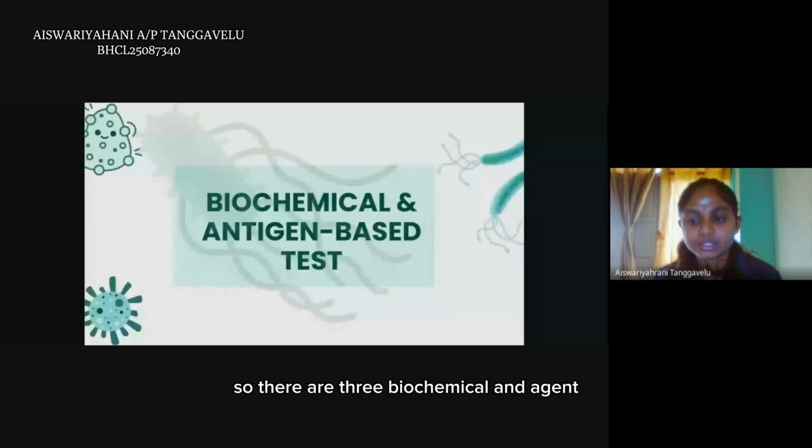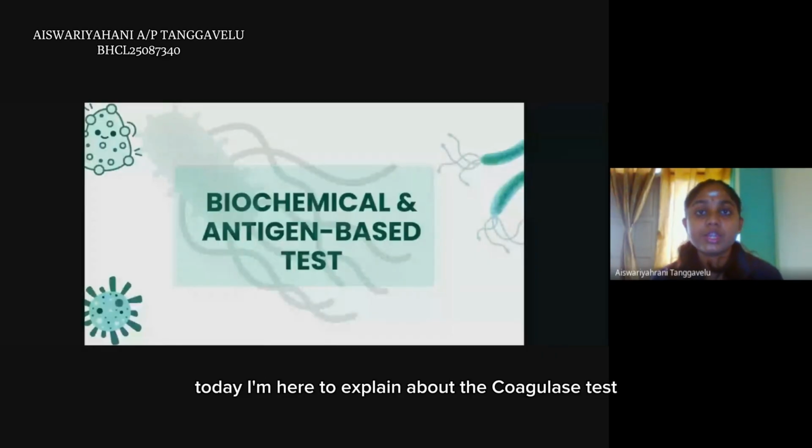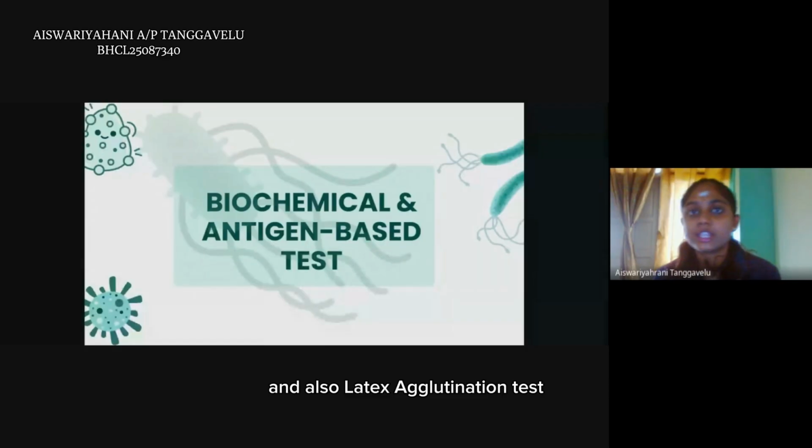So there are three biochemical and antigen-based tests. So today I'm here to explain about the coagulase test and also the latex agglutination test.